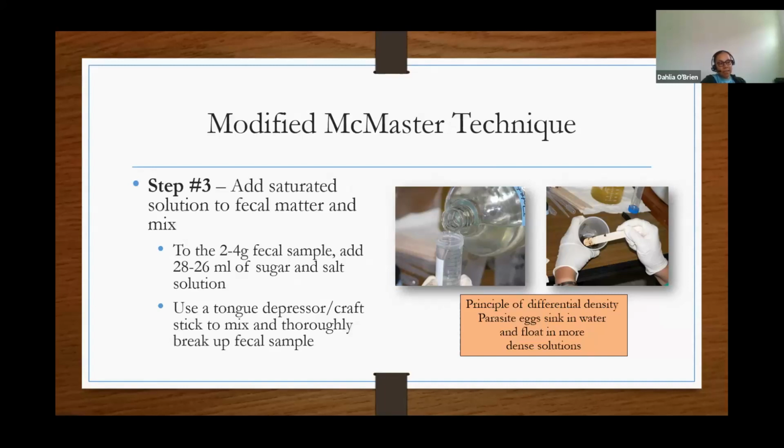I really like these disposable cups to do fecal egg counts because they're sort of graded or rough on the inside, so I can actually mash that fecal sample and break it up easily on the inside of that cup. But if you have really hard or tough pellets, when you collect the sample in a snap bag or a glove, you could take your hands and break up that fecal matter. Additionally, you could use a bottle or any other container and just gently massage that sample while it's in the bag or glove, just to help break it up a bit.